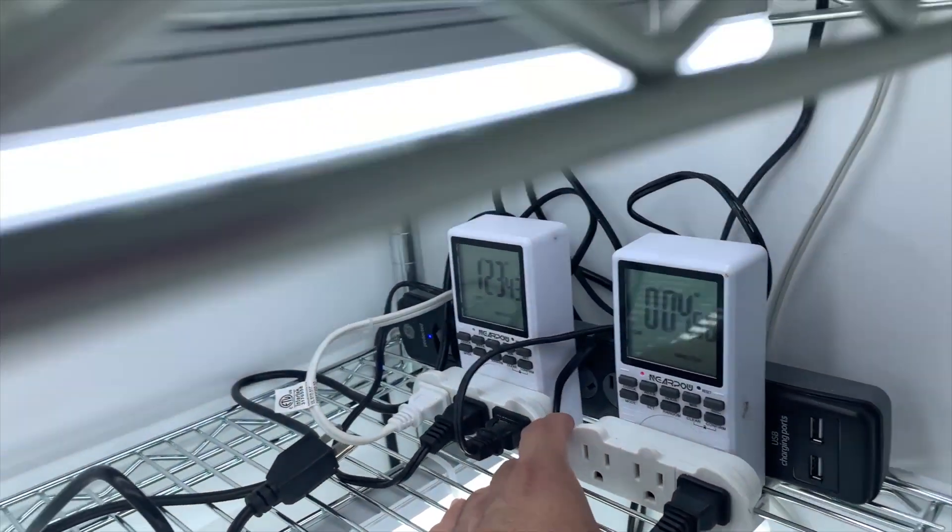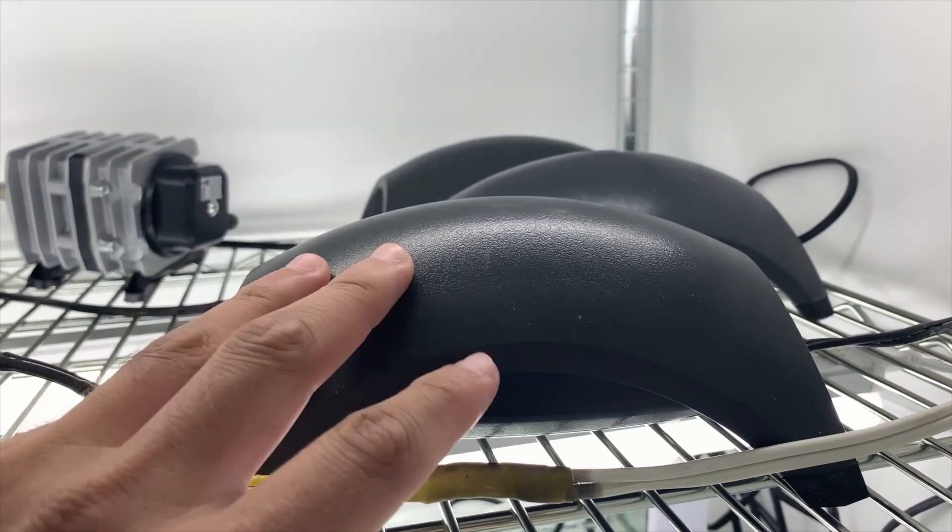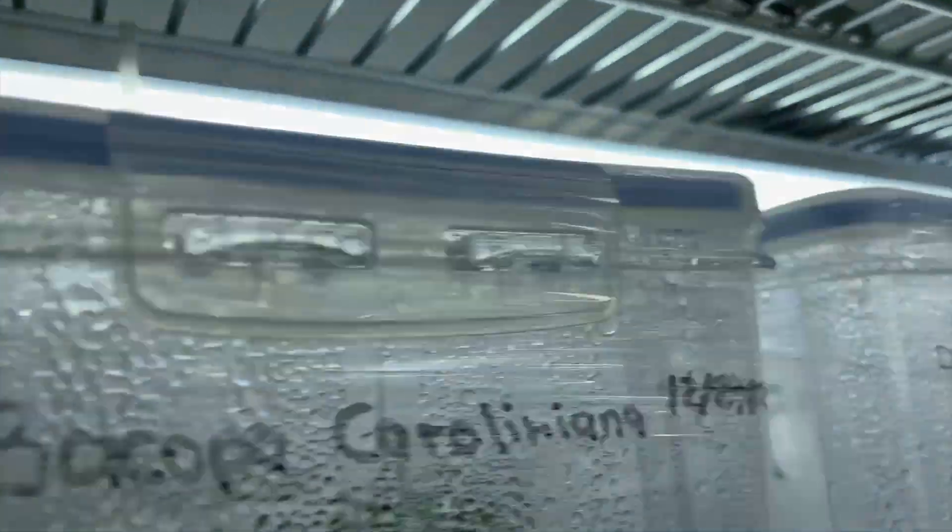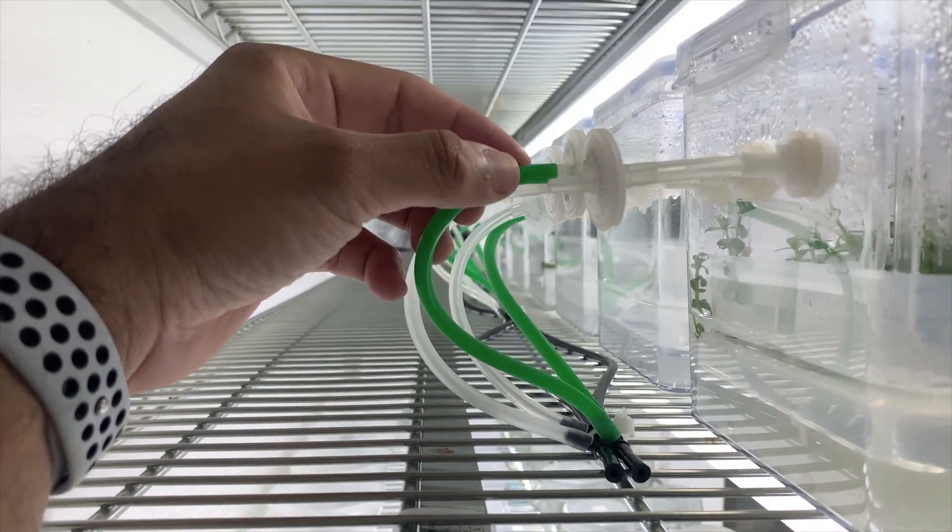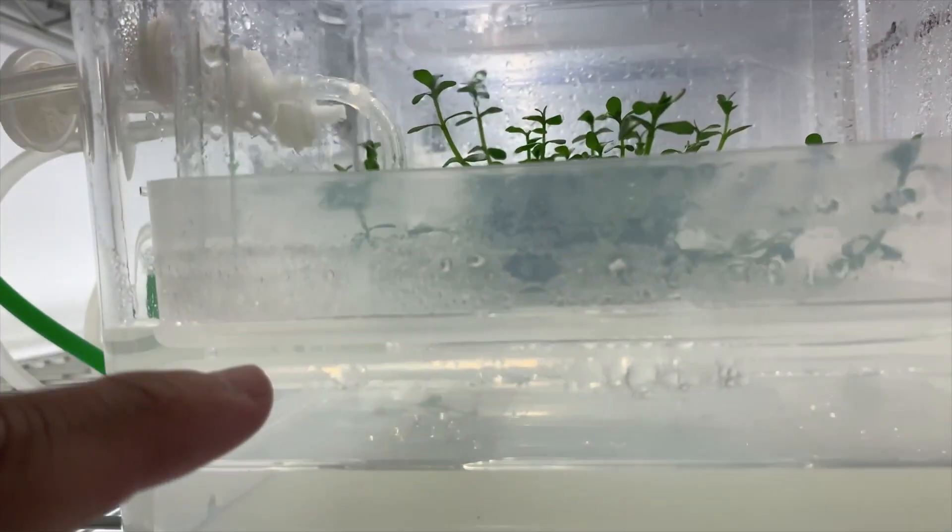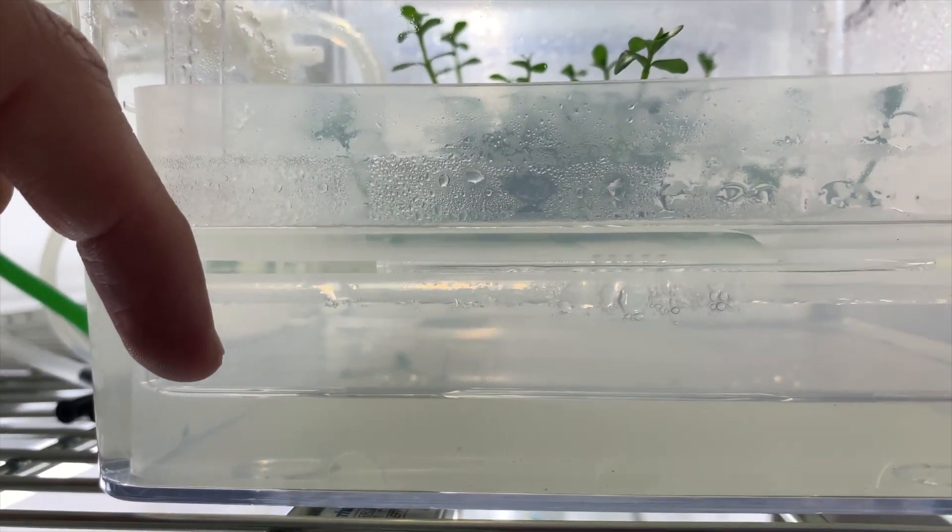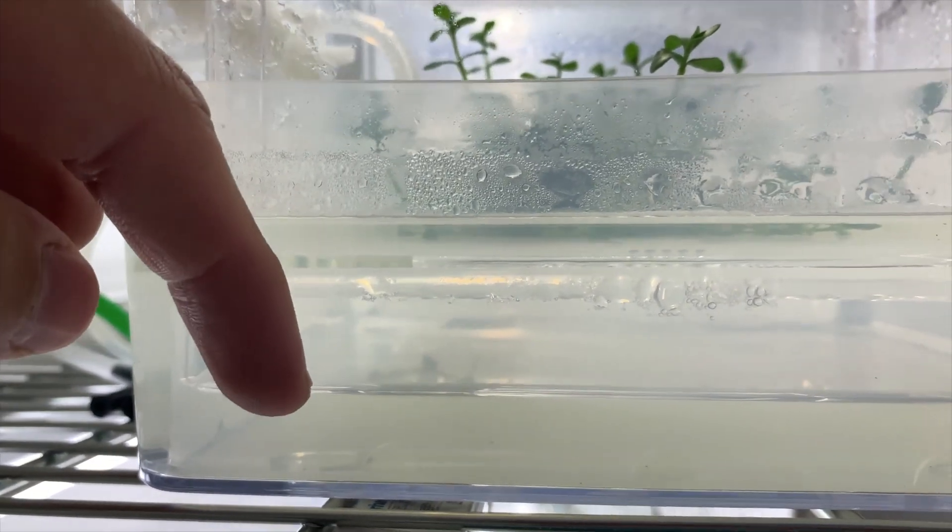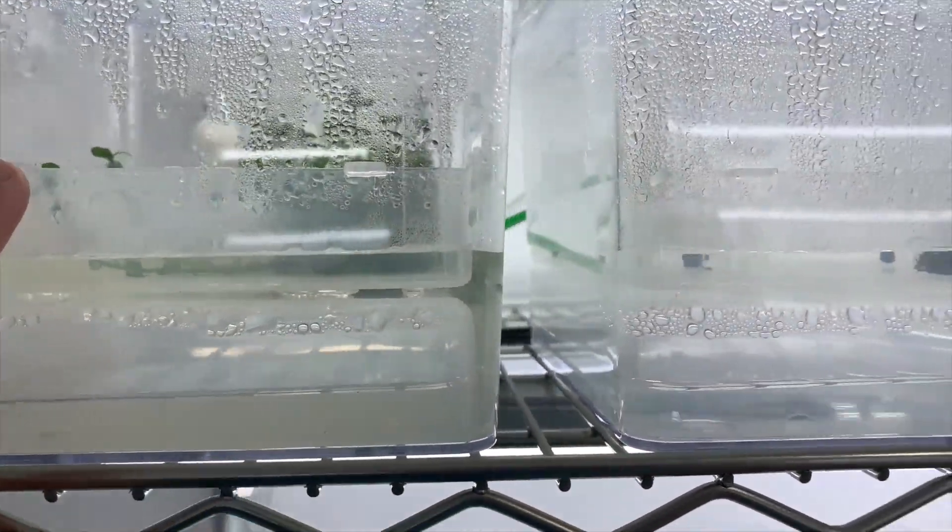What is happening now is that this is powering this pump and this pump is pushing air into the green tubes that go into the middle filter. The middle filter has the tubing that goes all the way to the bottom. This is putting air that at the same time is pushing the media, the liquid media down on this area, which makes the other liquid going up. So that is how the liquid or the media goes up.